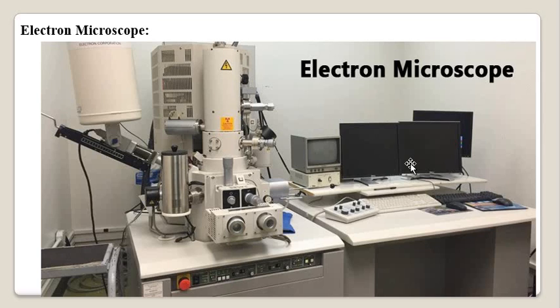Say this, for example, fluorescence screen, maybe this and maybe this one. So on this fluorescent screen, the magnified image is observed, not directly through the microscope, because the electrons are harmful to our eyes. They may enter our eyes and can cause damage to the retina.